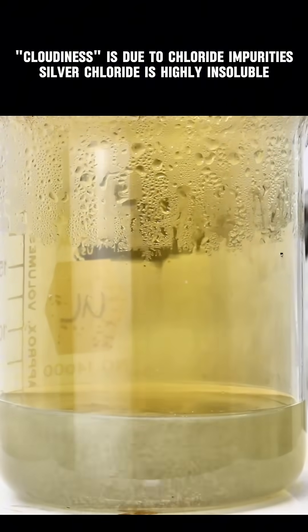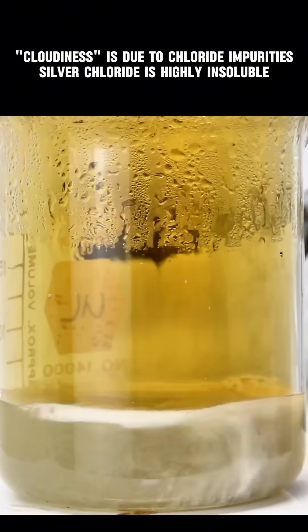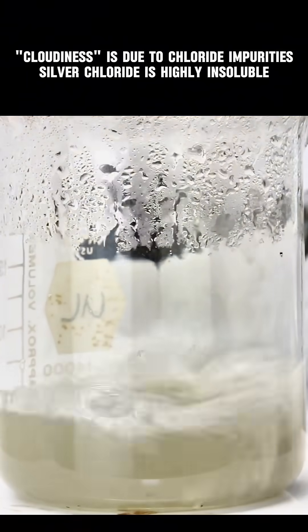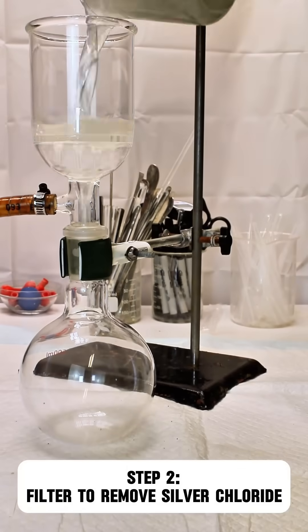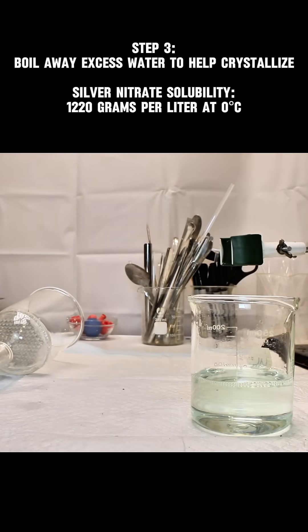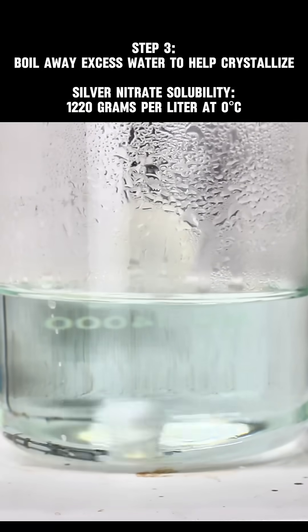Anyway, as the silver dissolves you might notice the solution become a little bit cloudy, and that's totally normal. This is caused by minor chloride impurities in my water which forms the incredibly insoluble silver chloride. I went ahead and removed the silver chloride by passing the solution through a fritted funnel a few times, and then boiled down the resulting filtrate.